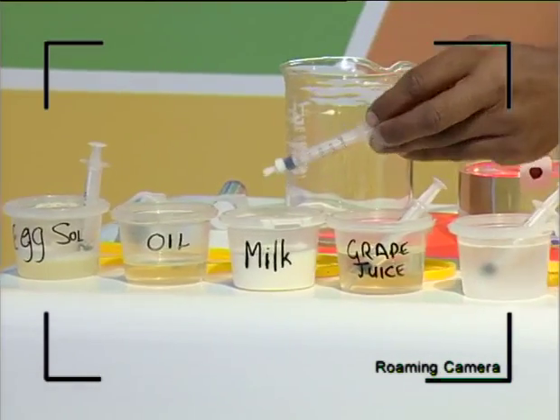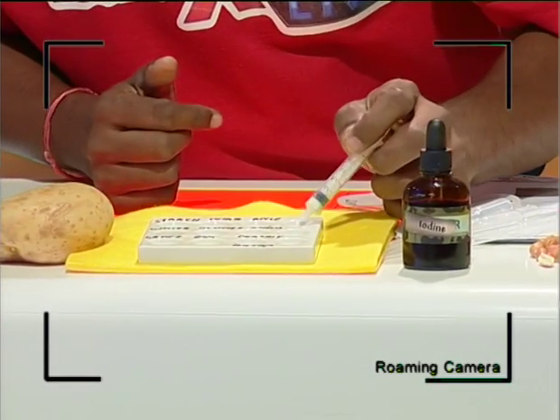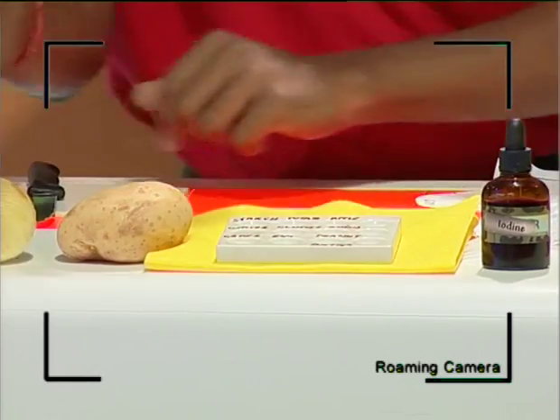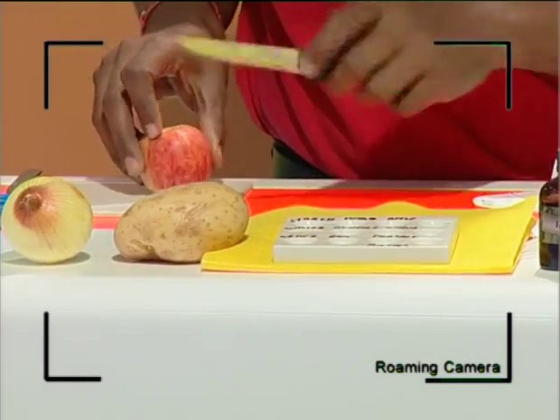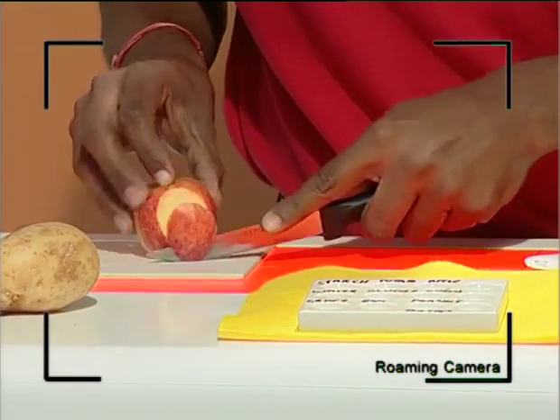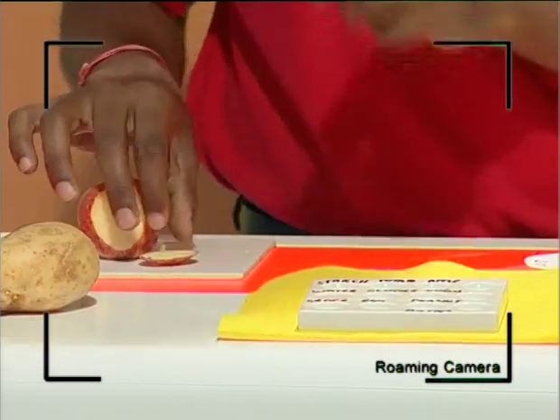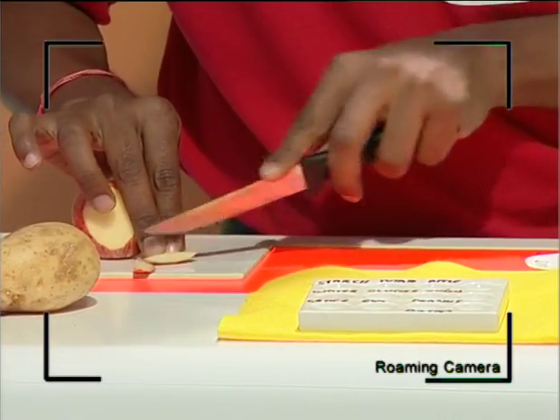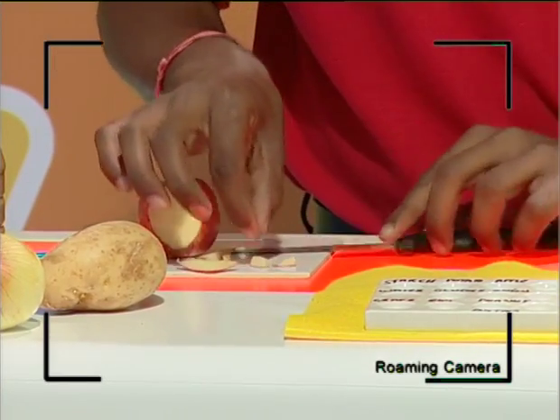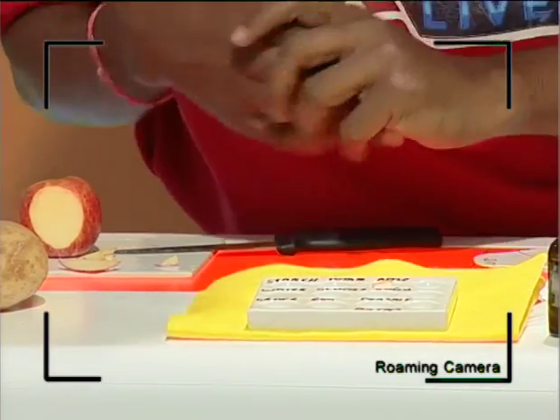Okay, so we've got milk in here. We haven't labeled milk, but I'm going to put milk right here just for you. We've got apple, so we're going to cut a piece of apple here, guys. I know that apple's your favorite fruit, and you know why? Because it contains lots of glucose. We don't know if it contains starch yet, but I'm going to do an interesting test at the end, and you're going to be quite amazed with what apples contain, and actually what they contain when they're ripe. So that's the apple that we've got in there.